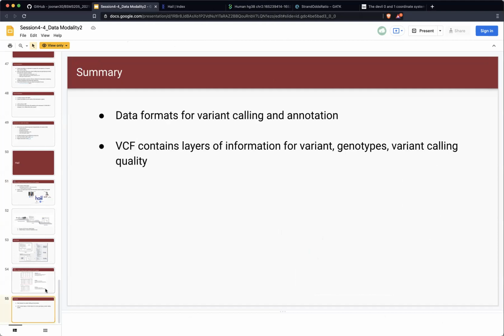Okay, so that is just a very brief update of how we analyze genomic data sets in the real world, and we learned about quite a wide range of terminology related to genomics and bioinformatics. But knowing the terminology is the first step. If you understand the concept underlying each process and analysis, then the terminology will be quite interpretable in the sense of genotype identification and variant calling. But if you just try to memorize the terminology bluntly, then it's going to be very tough. So please keep in mind to relate the concepts from Illumina sequencing to FASTQ and alignment and variant calling. Then all of that terminology will be tightly intertwined and quite digestible in your study.